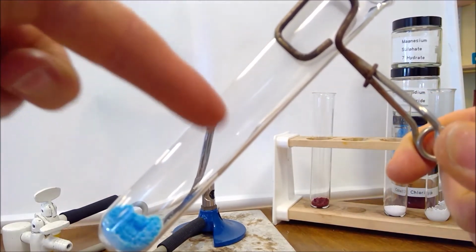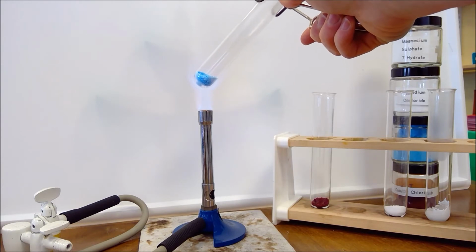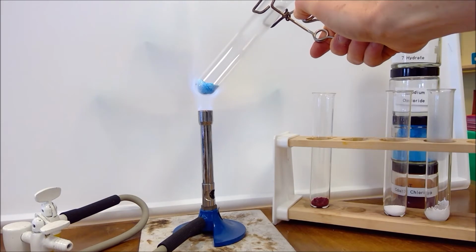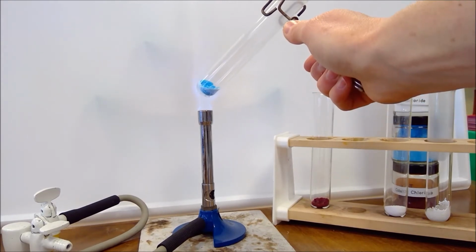We can maybe see that wiggly line in between where we haven't got any water condensing and higher up where we have. And start having a careful look at our solid as well. How has that changed?